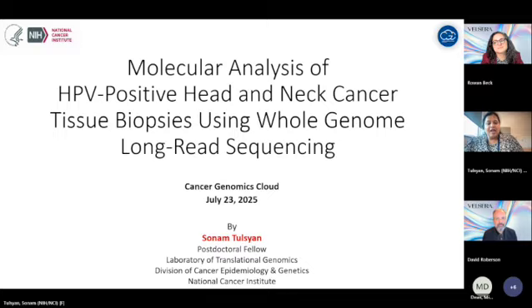I am a postdoc fellow in Dr. Mike Dean's Laboratory of Translational Genomics in NCI. Today, I'm going to talk about molecular analysis of HPV-positive head and neck cancer tissue biopsies using whole genome long-read sequencing.